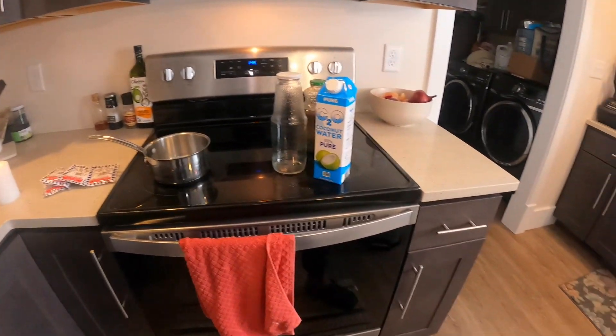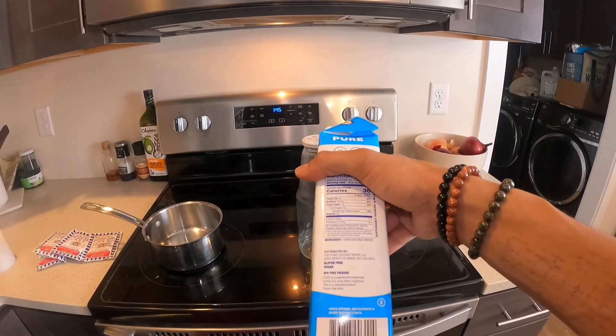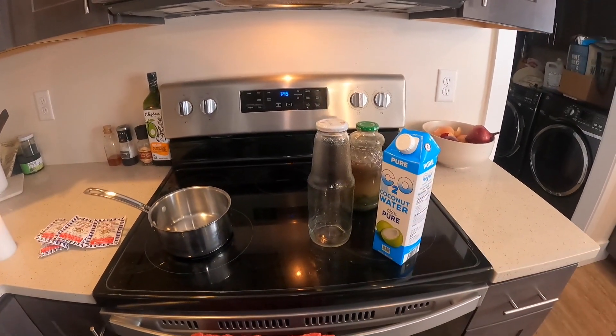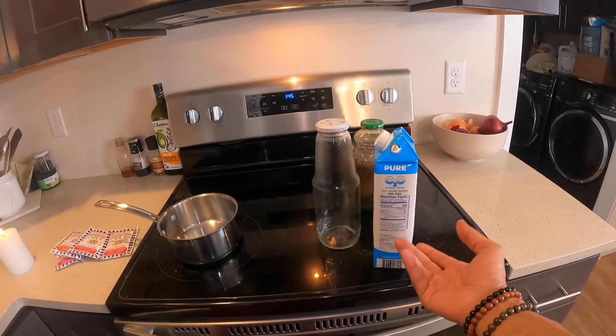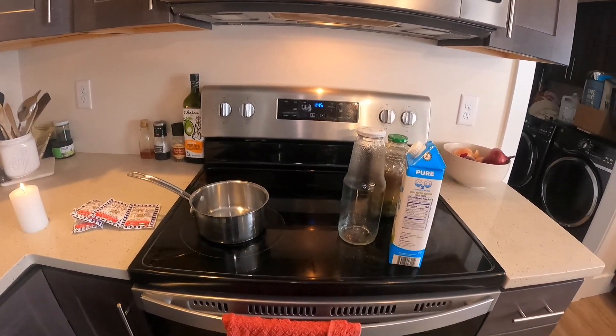I don't care if there's extra sugar because the mushrooms will be okay with it. You don't want anything that has a lot of citric acid in it, but if it does have extra sugars or anything like that, that's fine.